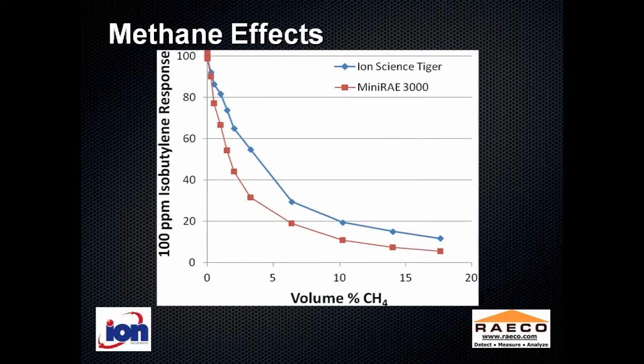Natural gas contains some benzene and some things like heavier hydrocarbons, and if you want to measure those, it's difficult to do this by PID. You need some other sampling technique.